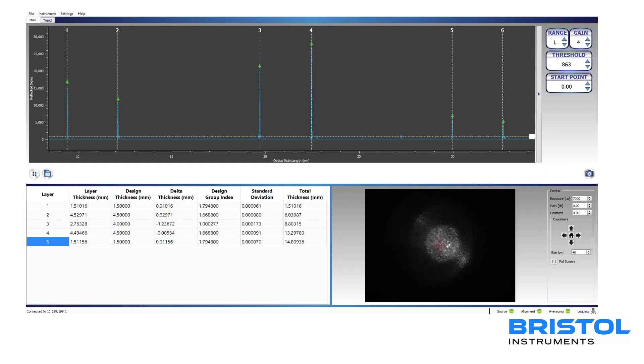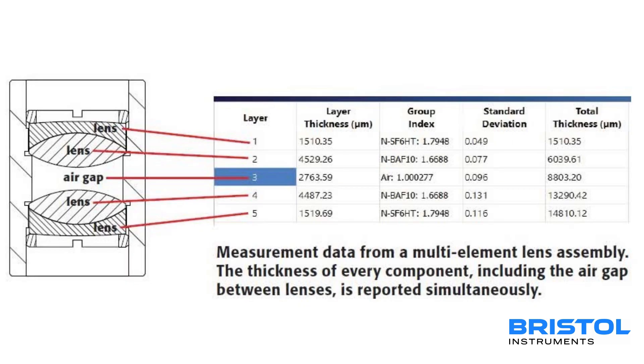Results are shown on the included Opti-Cal software interface. Here we can see the results of a dual achromat doublet assembly, which has two doublets and an air gap in between.